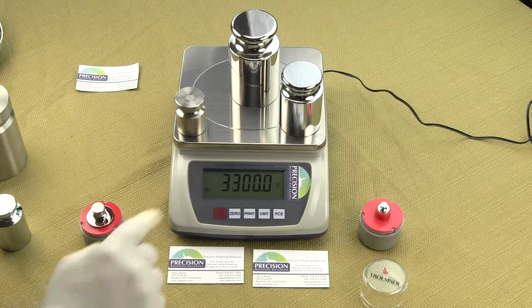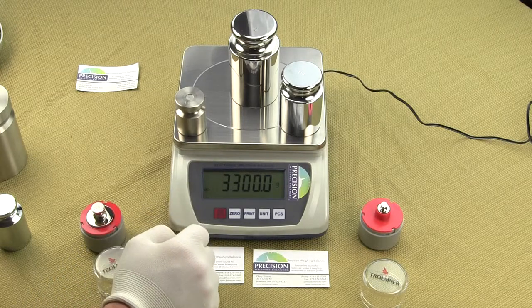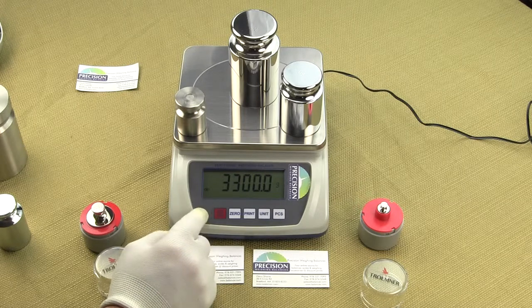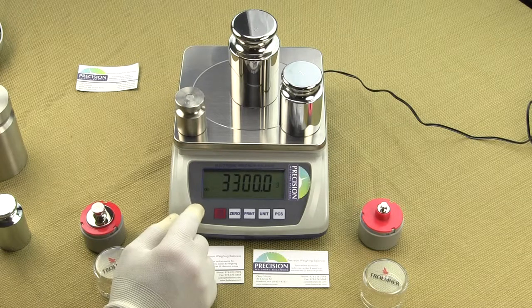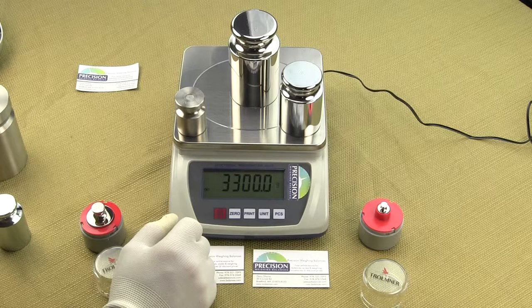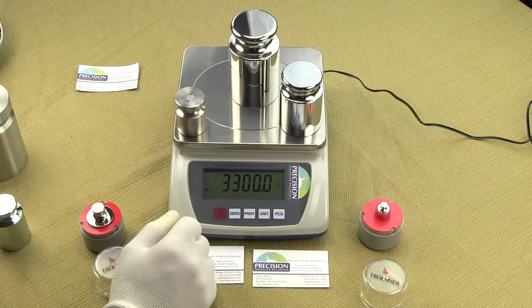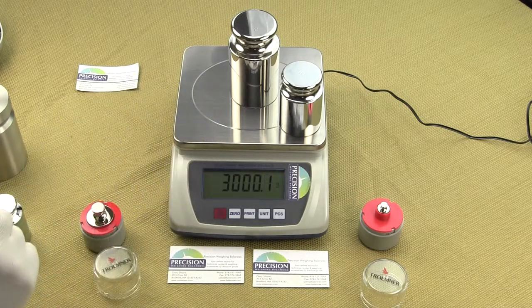The large 7-segment, 7/8-inch-high LCD display features a backlight for easy viewing and is one of the largest in this category for a portable digital scale. The backlight makes it easy for reading the weighing results from a distance or in areas where lighting isn't always the greatest. The fast stabilization time displays the results quickly.